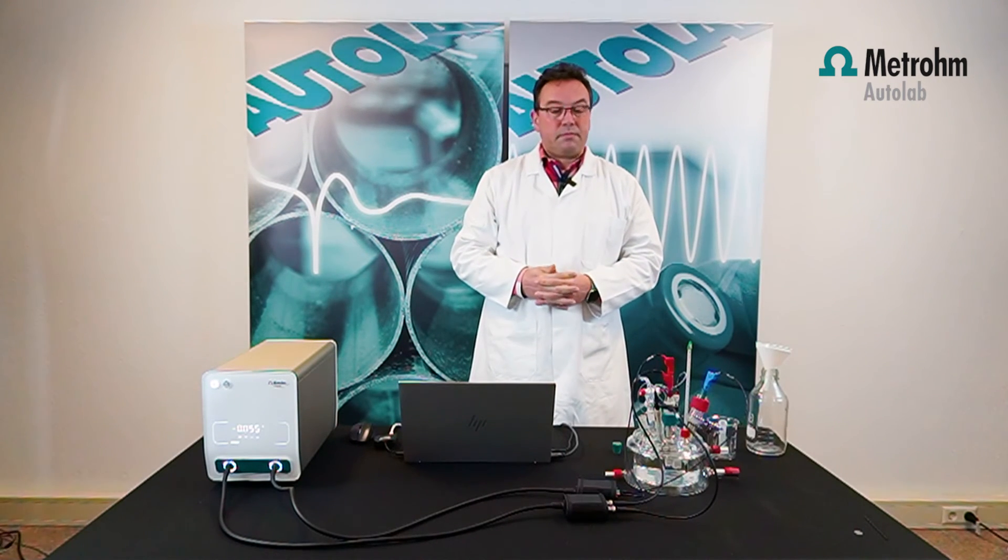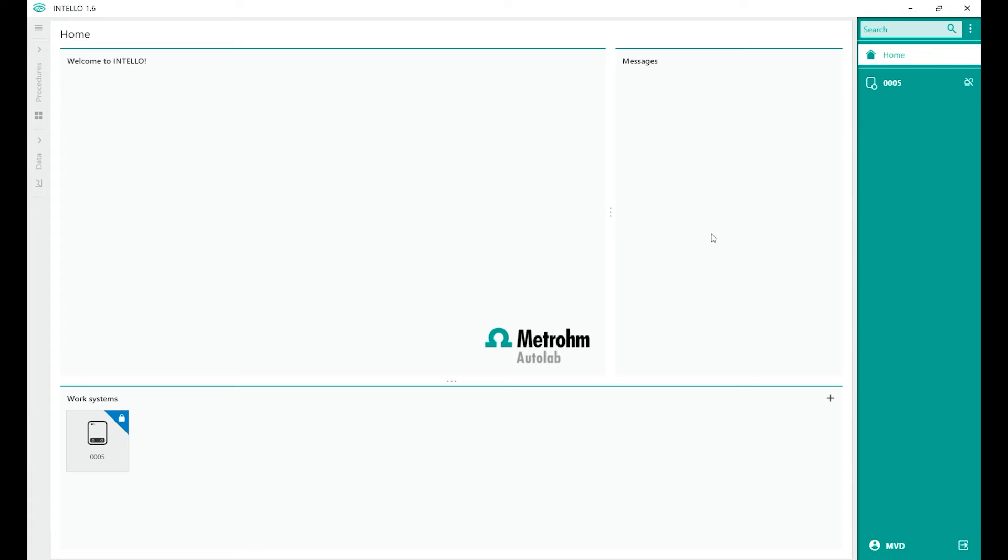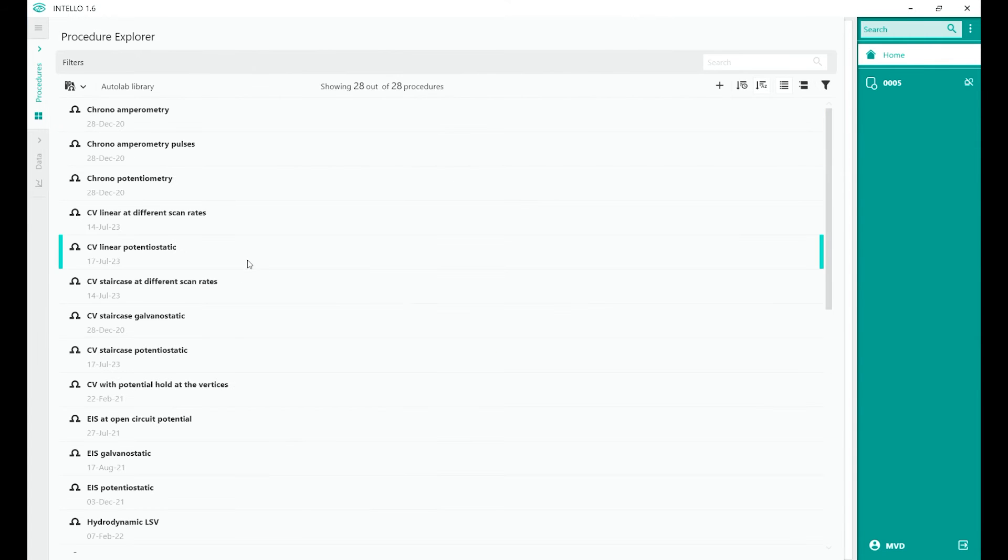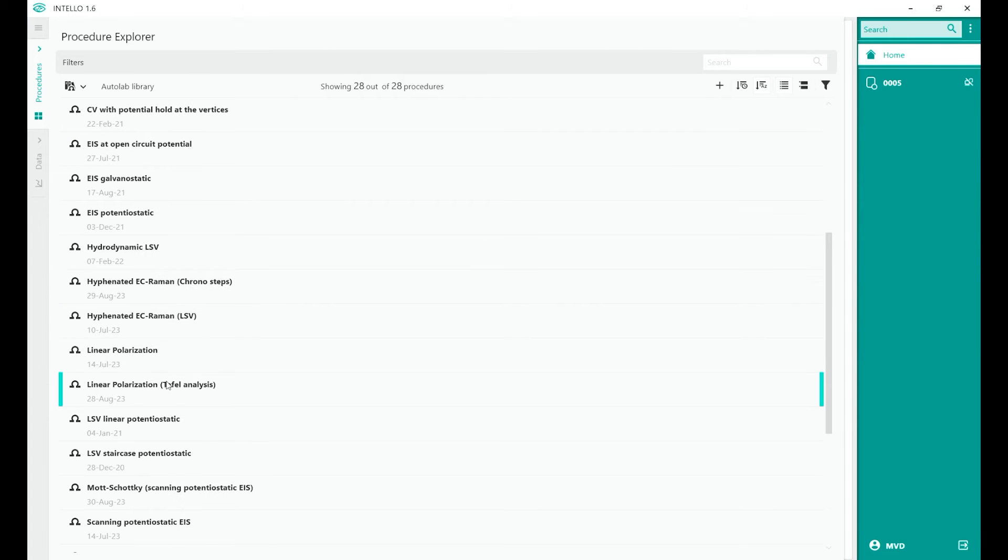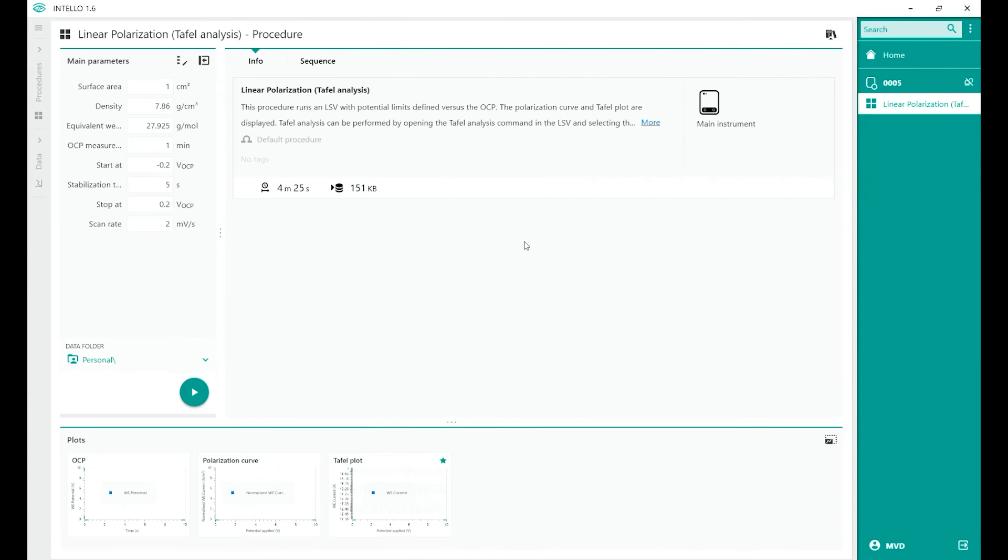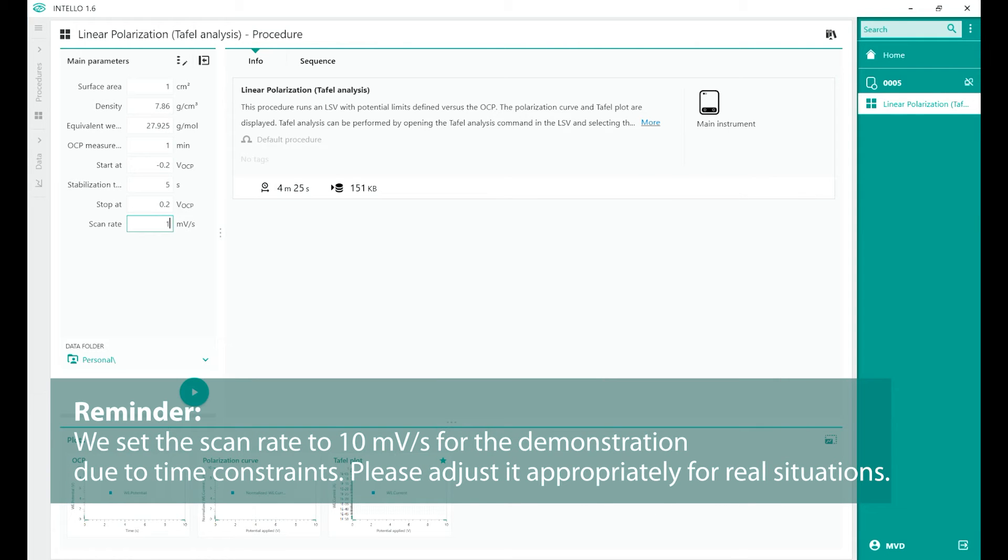Now we go to the software. In the software, there's a selection. You can go to the procedure. There's a standard procedure, default procedure, linear polarisation TAFEL analysis. Select that one. First, we're going to adjust the scan rate. It's now set to two millivolts a second, and we are going to adjust it to 10 millivolts a second. This is just for speeding up the process.